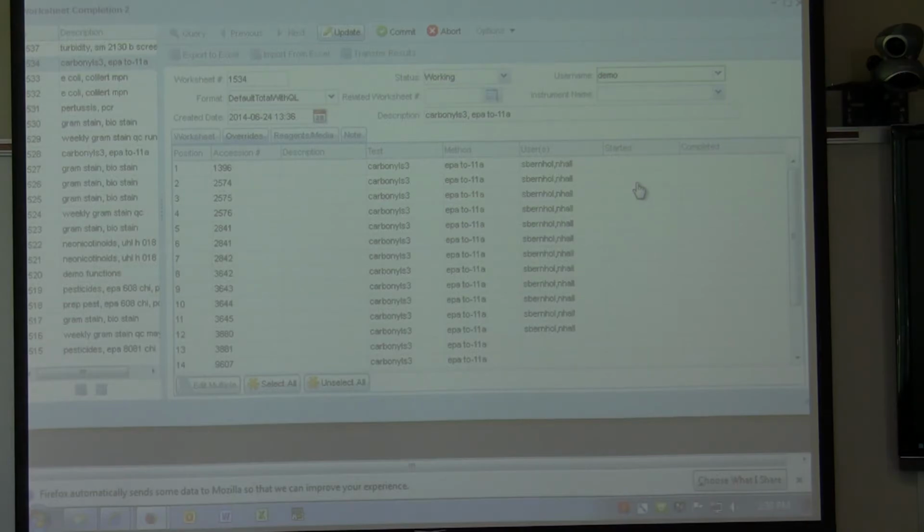That may be what it is, but there was no place to save it back in the database anyway, until now. Thought we had that. For the QC, are you talking, okay, so you're just talking about the QC and QC's old. Right, so the wrong date's on for the QCs. I always take the dates out, because I never saved them before anyway, I just deleted it. Yeah. I didn't know if that was being fixed or going to be addressed, or if we should just ignore it.